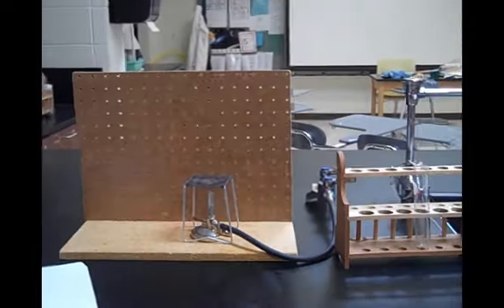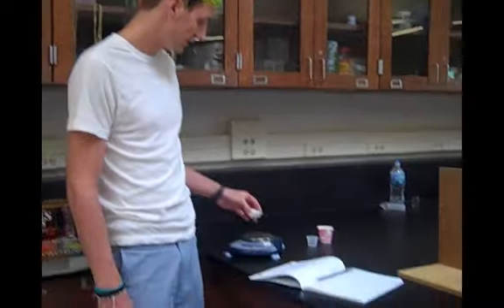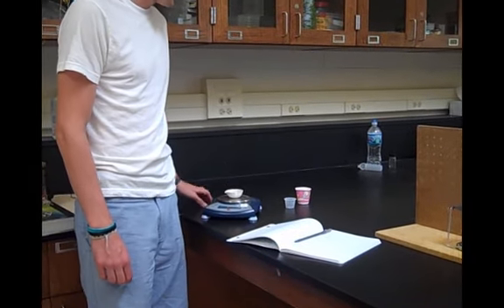Once you have that, the first thing you're going to do is record the mass of your evaporating dish. I record my mass.